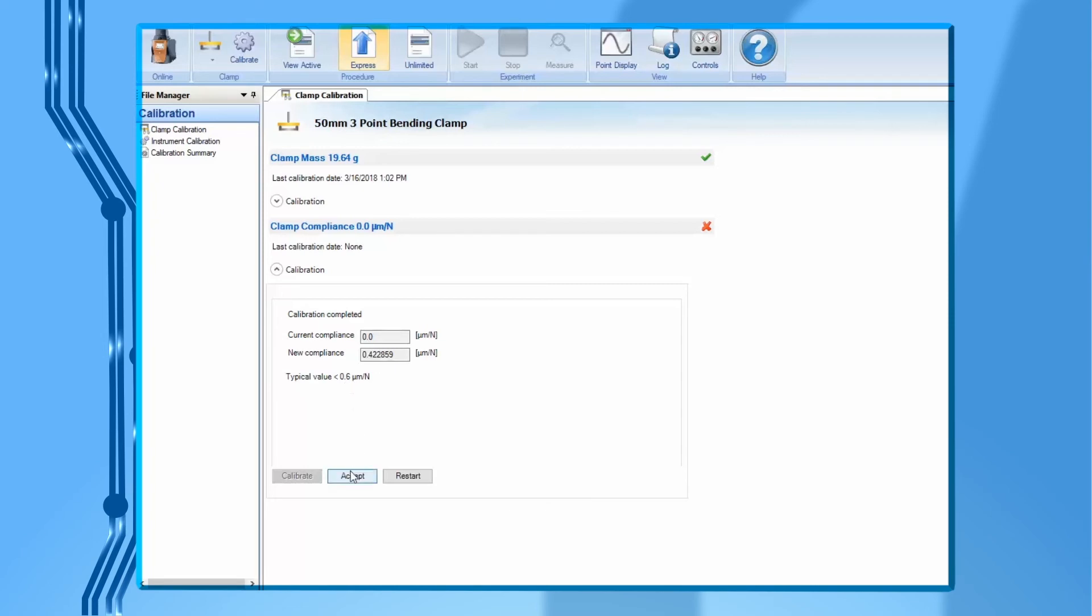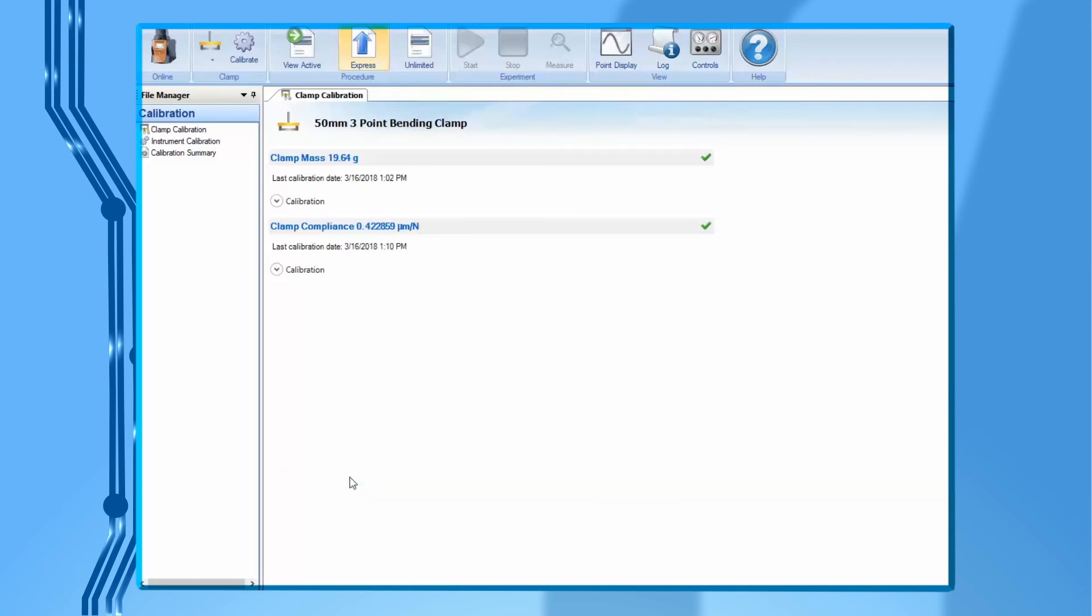When all calibrations has been completed, you should see green check marks on each calibration step. Then close this page in TRIO's. You are now ready to use this clamp.